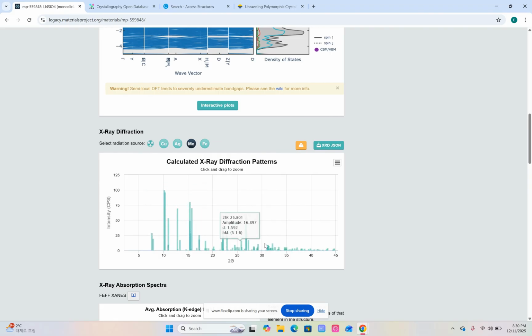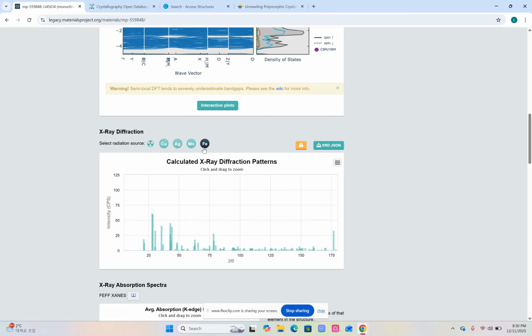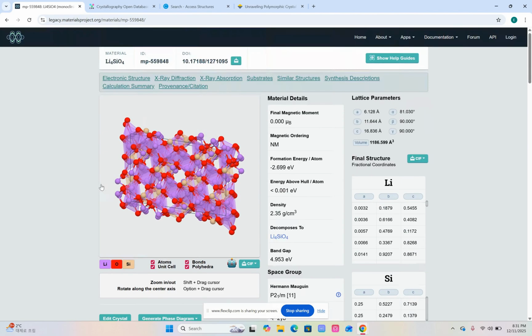Just have a short look or just realize that they are not equal. And this is something we should consider. And we also have to mention this to the software, because the software will directly run the calculation based on the X-ray source. Okay, nice database, but not suitable for us at the moment.